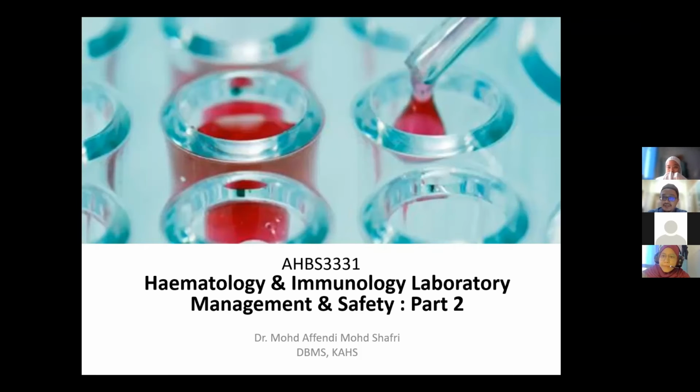So we apply. We tell them that we want to get this. So they will ask for documentation. Ada tak kita punya system, the SOPs. So please submit to us. And then what is your evidence of training schedule contohnya. Kita kena provide. Dia lengthy lah, dia akan check every single part. Some labs at Kuliah of Medicine, they are also ISO certified. Lab CAS belum certified lah.